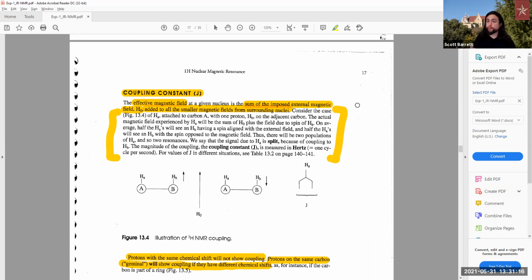Now you know there should be, in that case, 6 hydrogens at 5 ppm, which is random, and you run the experiment, and then you see the 5 ppm. Oh, there's my spot. You integrate it. Nice, 6 hydrogens. Then you've confirmed your compound is correct. So that's an instance of where we would use proton NMR in a real life example.